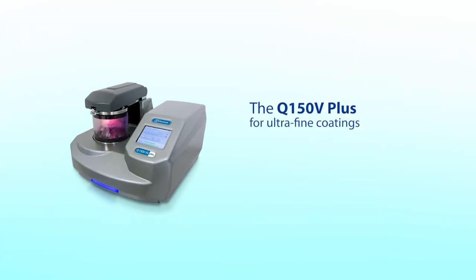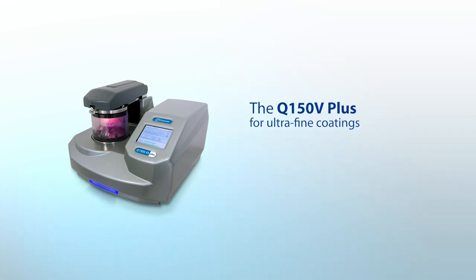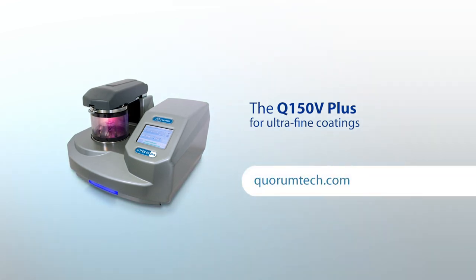The Q150 V Plus is a versatile tool for producing ultra-fine coatings. For more information, please visit our website.